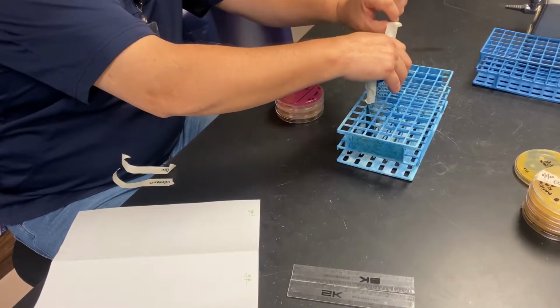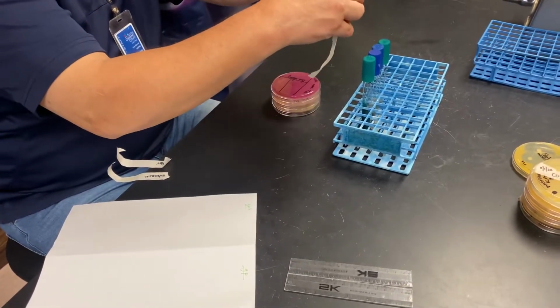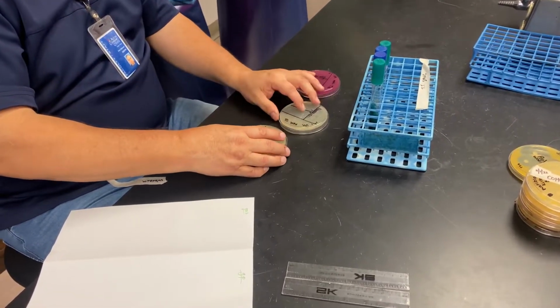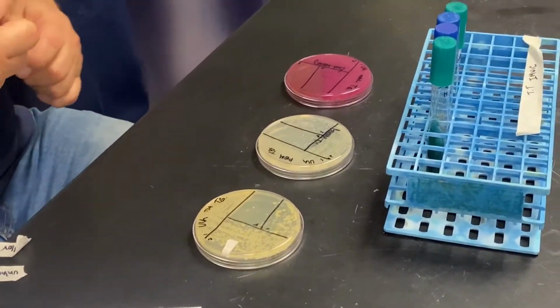It's not going to make any sense, but it's going to allow us to talk about results. So if I'm going to work these up, I've got gram-neg, I've got my gram-pos, and I've got my mixture, right? So I'm going to go ahead and take notes on here.